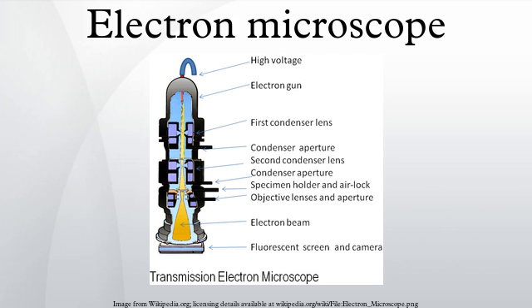Scanning electron microscope. Unlike the TEM, where electrons of the high-voltage beam carry the image of the specimen, the electron beam of the scanning electron microscope does not at any time carry a complete image of the specimen. The SEM produces images by probing the specimen with a focused electron beam that is scanned across a rectangular area of the specimen.